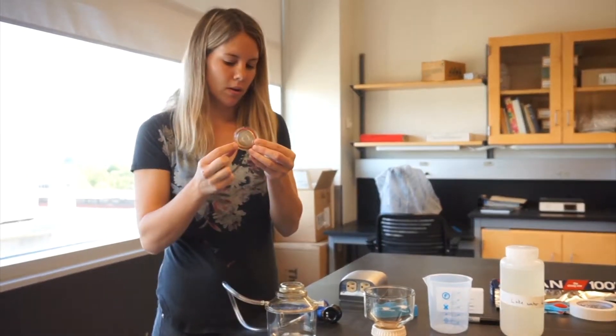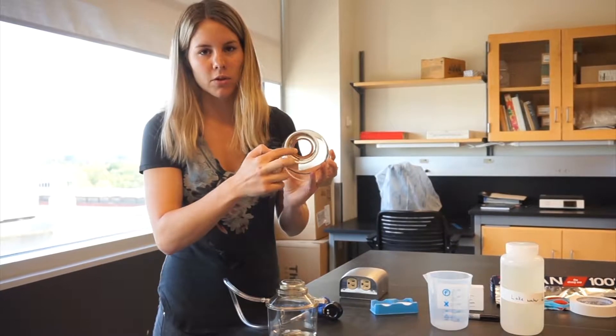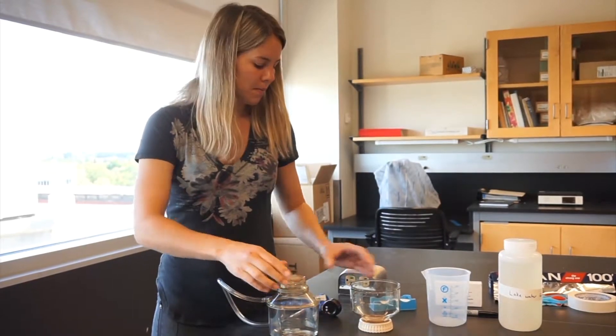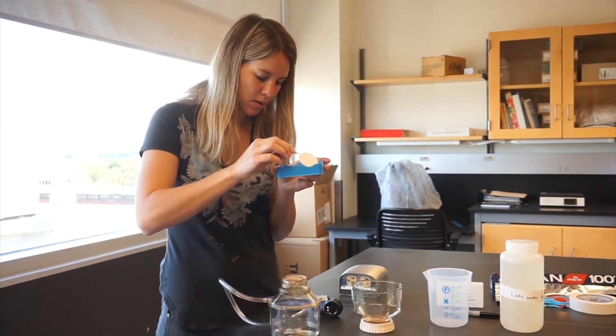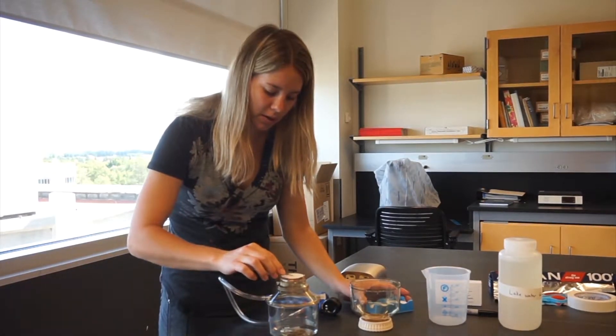Check the O-rings on both the middle piece and the top piece. Make sure that they're in place so that you can create a seal. Then you'll attach the middle piece to the bottom. Using the forceps, get a piece of filter paper and set it in place on the filter holder.